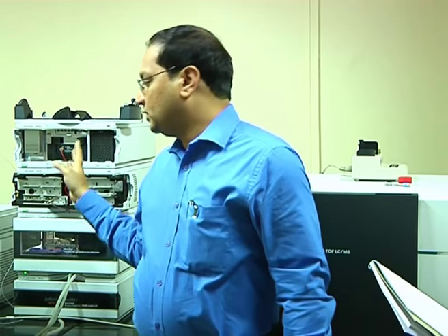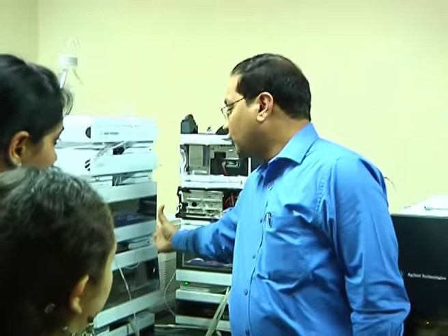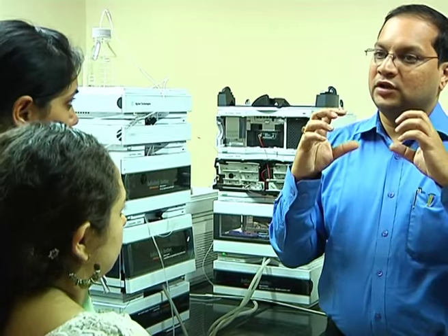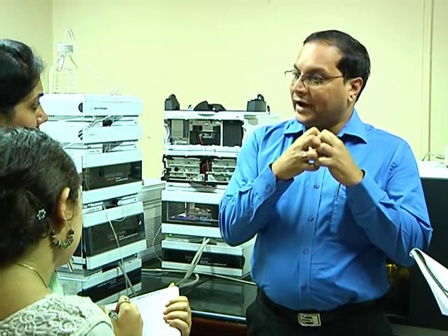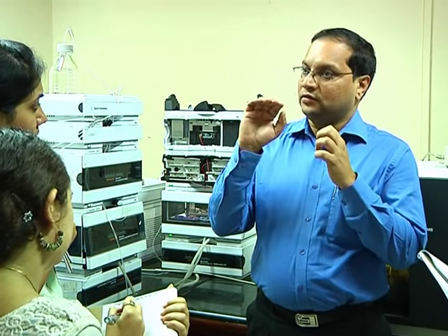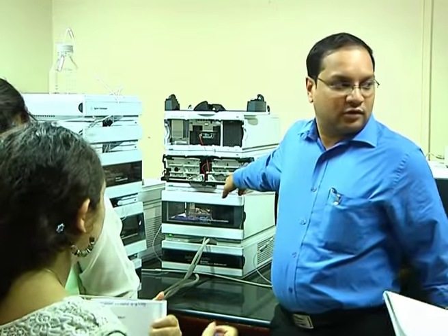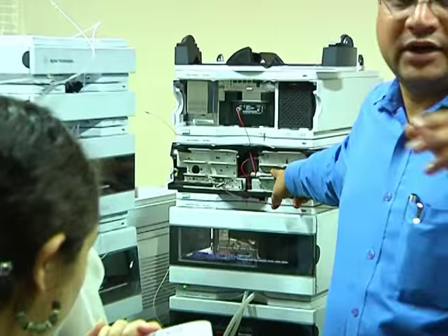So if you look at the HPLC configuration, the basis is that it's a separating device. There is a module called the pump, a binary pump, typically two pumps. What is the purpose of two pumps? To pump the mobile phase. And typically what type of mobile phase do we use? In the case of peptides, it is hydrophobic interaction. Based on hydrophobicity, it will bind to the stationary phase, and then you elute by changing the polarity. We have the pump, then we have a column compartment where you put the column. Typically, it's heated, so you can heat it to have better separation.